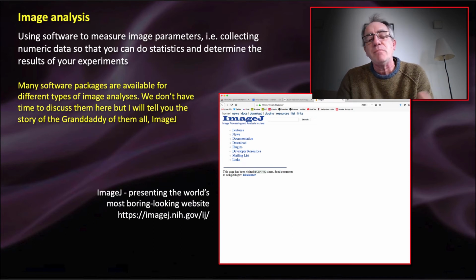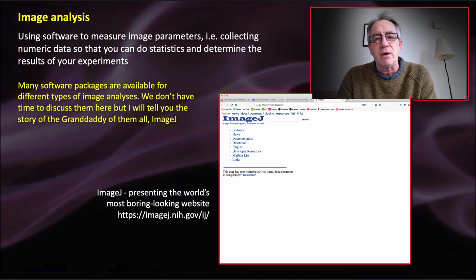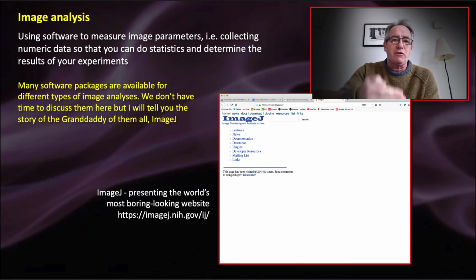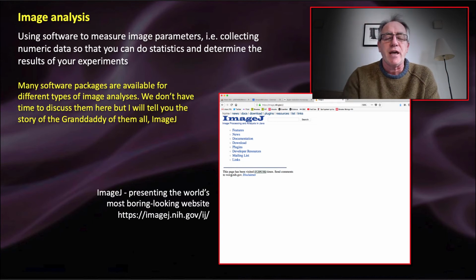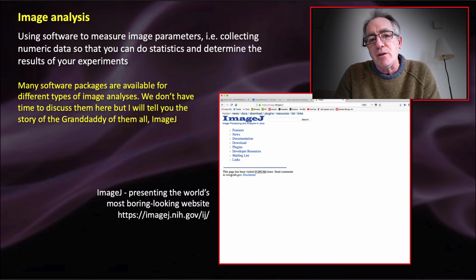Or it might be a slower process like cell division, and you might say, image this field of view for 30 minutes, make, for example, 1 image every 15 seconds. So the microscope does that. It scans the field of view, waits 15 seconds, scans the field of view again, and does that for 30 minutes. So that's 4 images per minute for 30 minutes, something like 120 images, and you put all of those 120 images together, speed them up, and that's how you make a video, a time lapse, as it were. So you can generate a huge number of images.